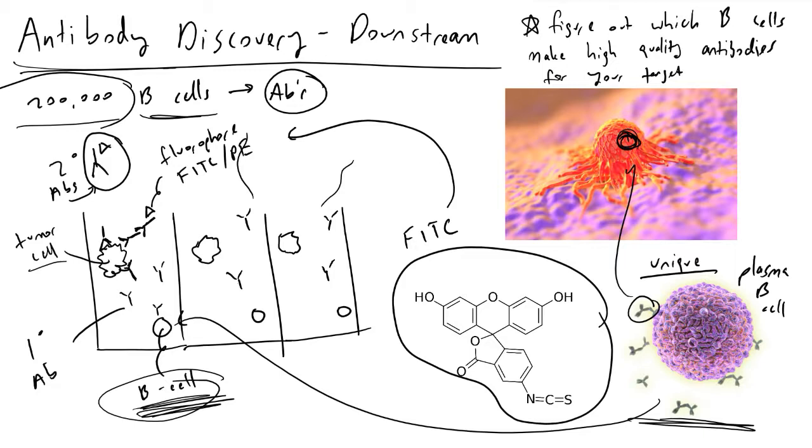And so as we let time progress in our experiment and we flood our well plates, our quasi well plate, essentially a micro well plate, with tons of our secondary antibodies, what's going on here is that we've got our secondary antibodies that continue to bind into, I'll call this pen 1, this will be pen 2, pen 3. We're going to have tons of our secondary antibodies sticking onto our primary antibodies that are sticking onto our tumor cell, which is very good to us because now we've got a high concentration of fluorophores localized in a region. In this case, it's our pen 1.